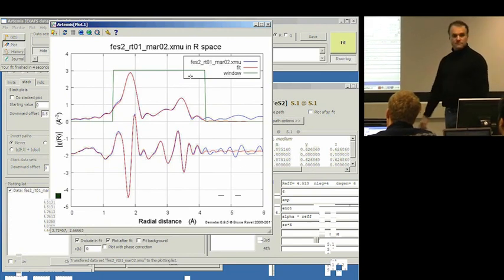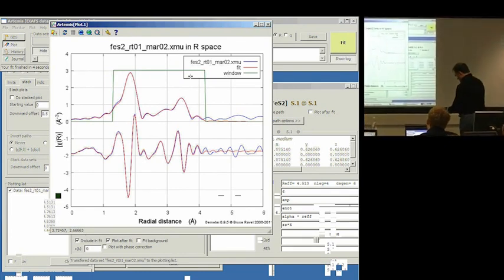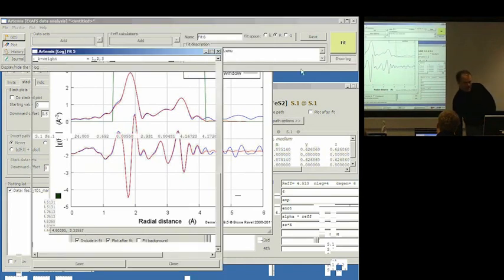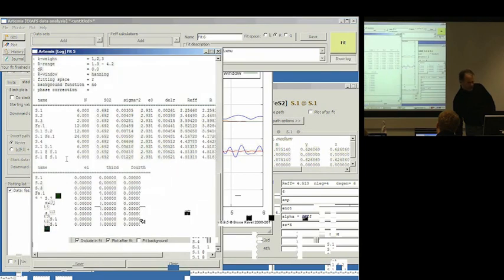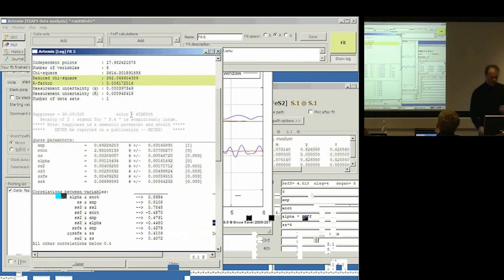So now this is sort of unimpeachable. You'd have no problem publishing this fit. That looks great. How do the numbers look? Why does it do that? So this number got a little bit smaller again. Drat. That's still reasonable.